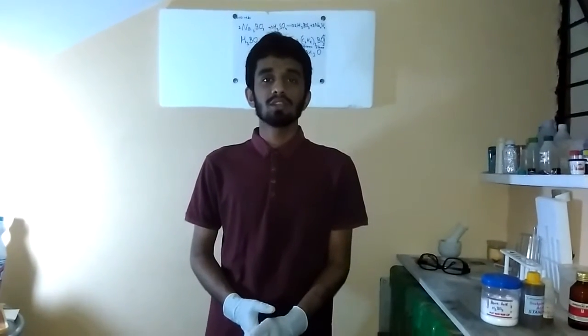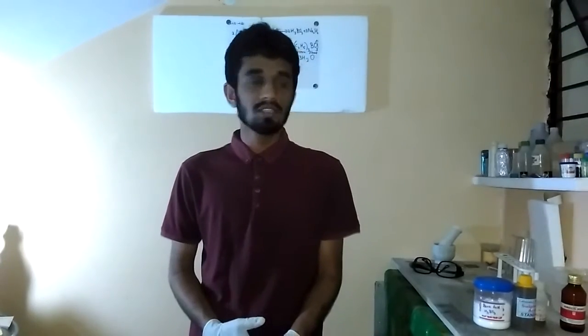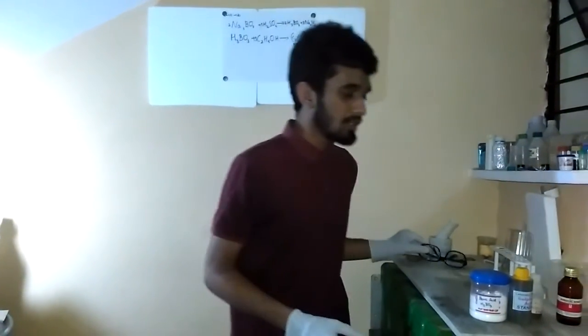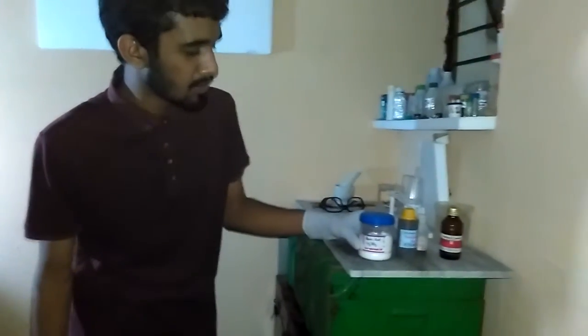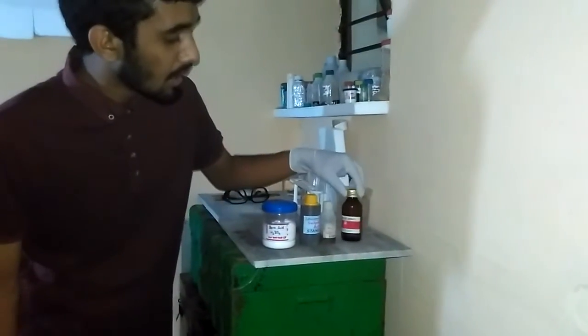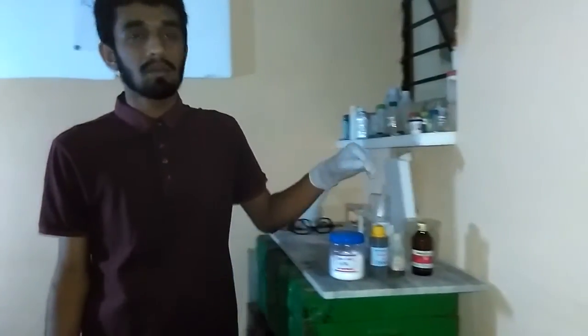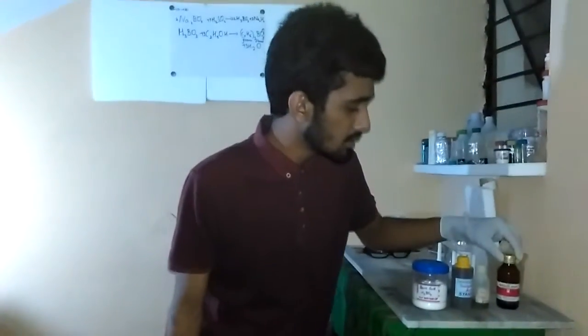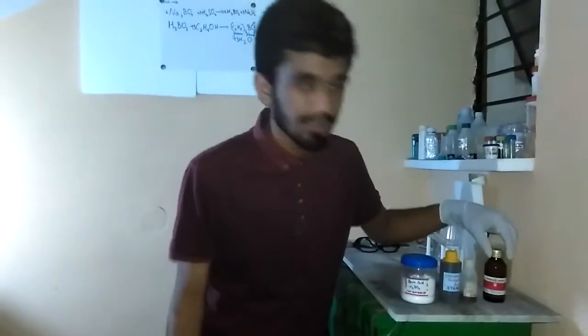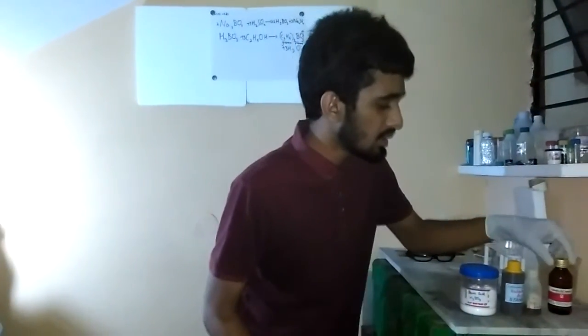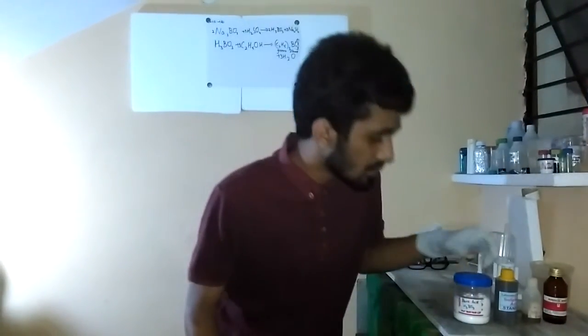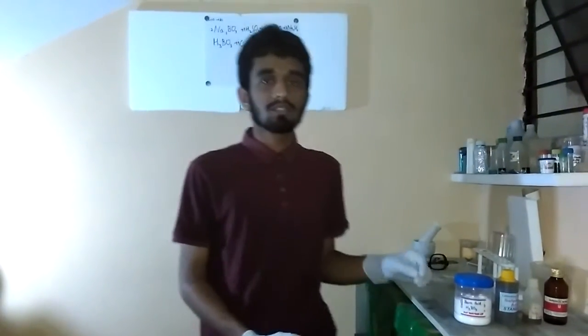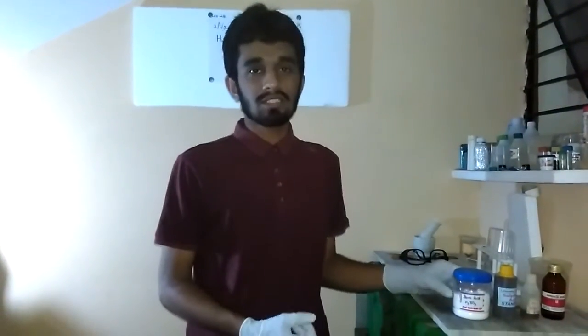I will be detecting the presence of a borate ion in this video, which is BO3-, and the chemicals which are required for this demonstration are a borate, in this case boric acid, some sulfuric acid, and some surgical spirit or ethanol. This surgical spirit is 95% ethanol with some methanol added to denature it. Instead of boric acid, you can also use any borate, for example sodium borate.